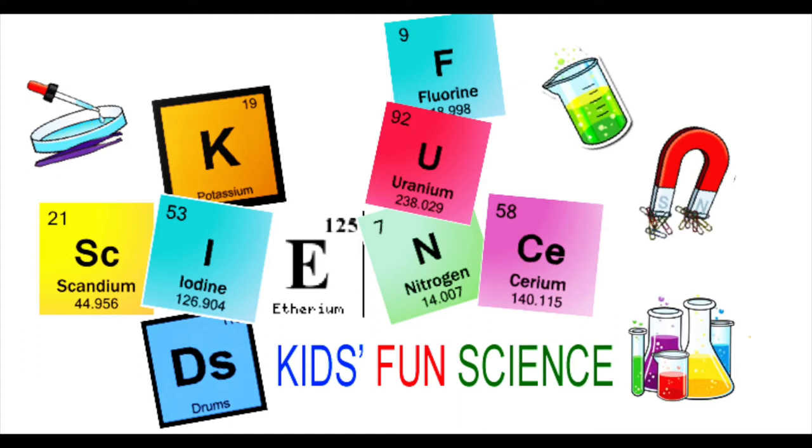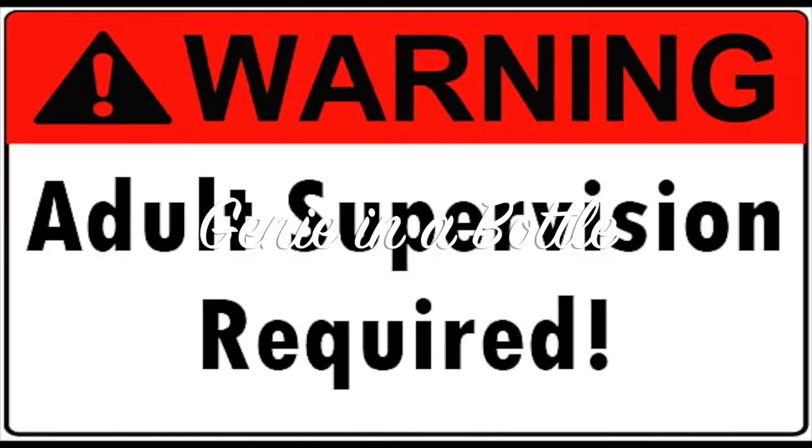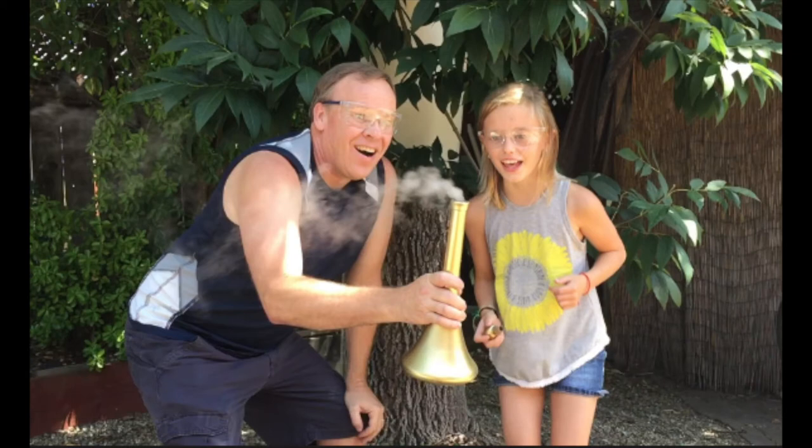Welcome back to Kids Fun Science. My name is Ken. Today's experiment is a genie in the bottle. As always, adult supervision is required. What you need for this experiment is a bottle, manganese dioxide, 30% hydrogen peroxide, thread, tissue, tape, and a princess — Princess Grace.